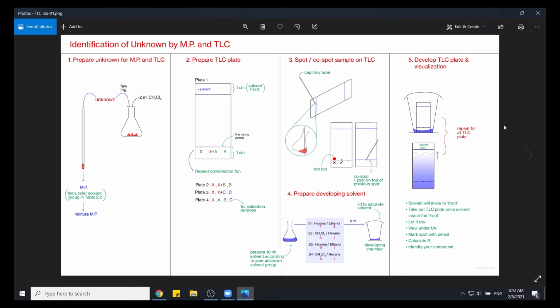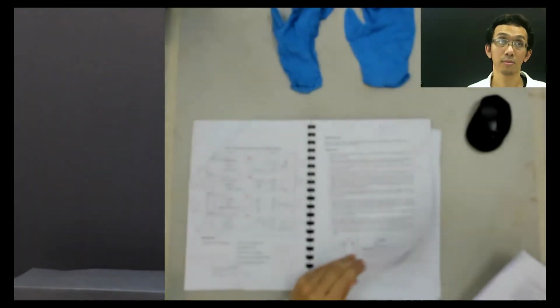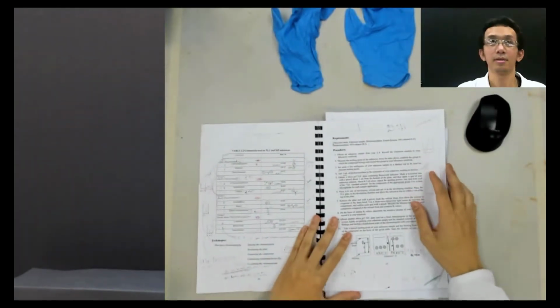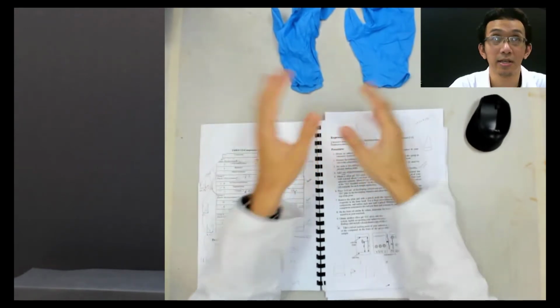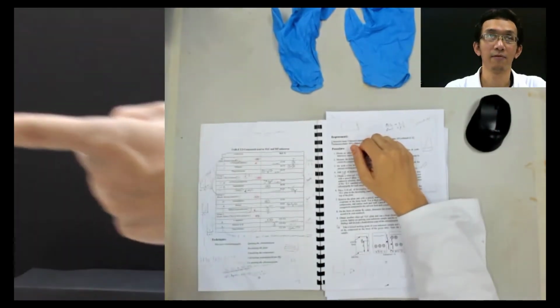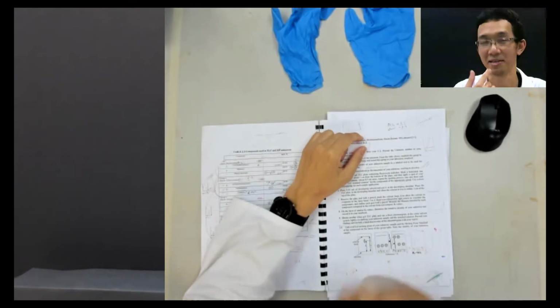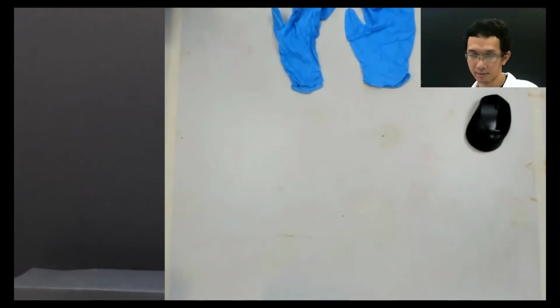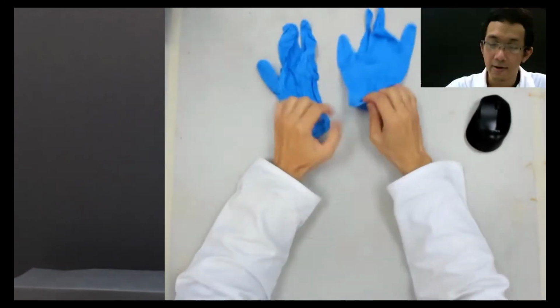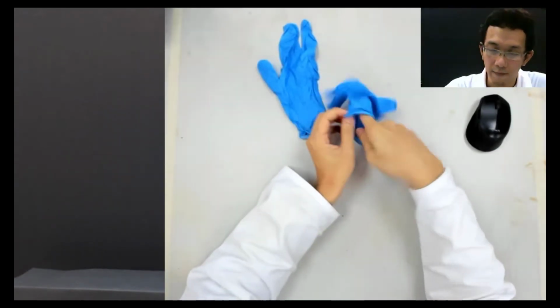So let me change the view. Can you see the 3 cameras now? Can you see this? Yes. Main view, side view, me. Okay, so let's put this somewhere else. Okay, first, as usual, I need to wear the gloves.